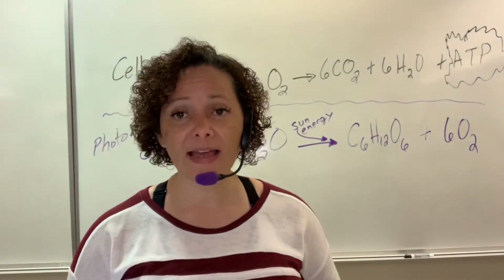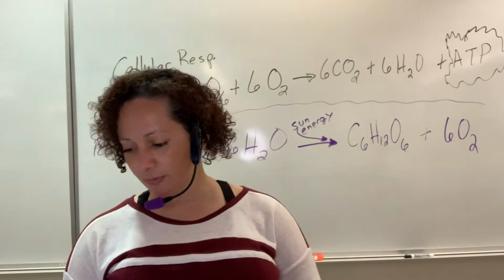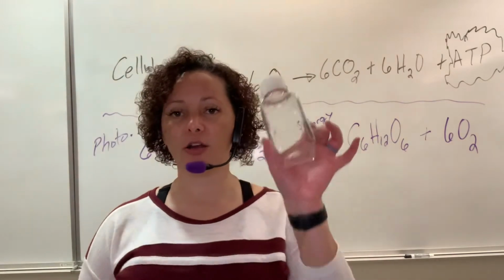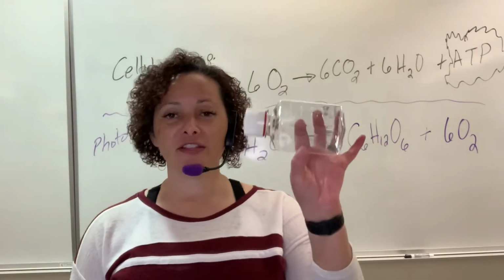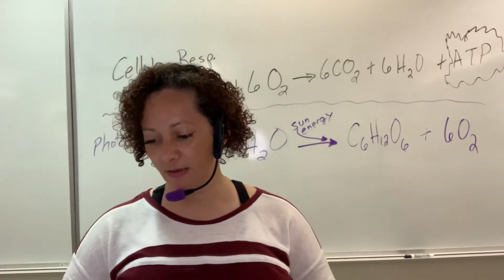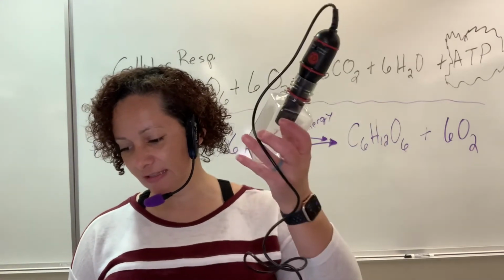Now we need to go ahead and the probe should, hang on, where am I? Oh, we have this thing called our respiration chamber. I'm just following your instructions here. This respiration chamber, you're going to put the CO2 monitor in the respiration chamber, just like such.